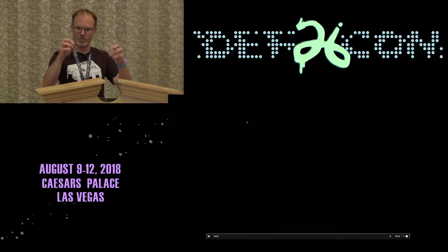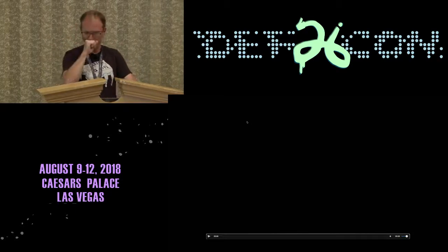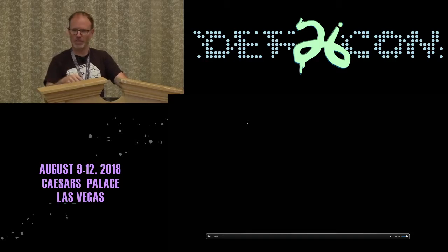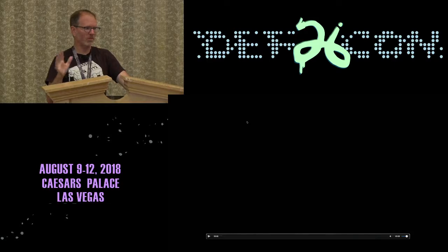And so he's created the droplets moving in a big circle, and then he's also able to control the position of one of the droplets with a joystick that's on the board. So it's pretty versatile, pretty crazy stuff. Also, he has feedback. So he's able to tell where the droplet is on the board as well.